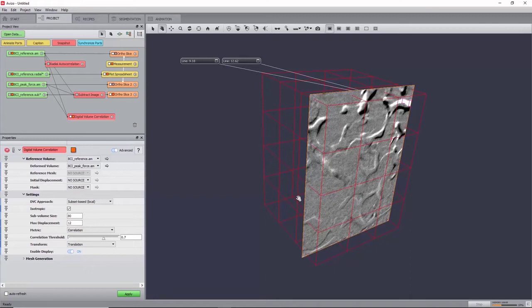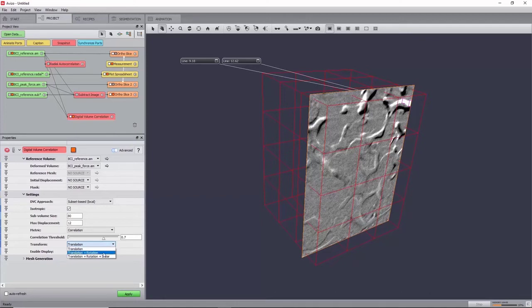Finally, set the transform port to Translation plus Rotation, and now run the algorithm by clicking Apply.